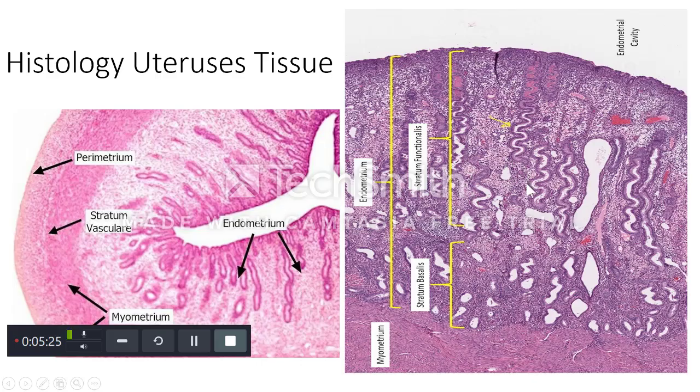You can see this picture, okay. Only the endometrium consists of a surface layer, spongy layer, and basal layer, okay. The surface layer and spongy layer form the functional layer, okay. Surface layer in this part, spongy layer in this part, basal layer in this part, okay. Thank you. Next slide.